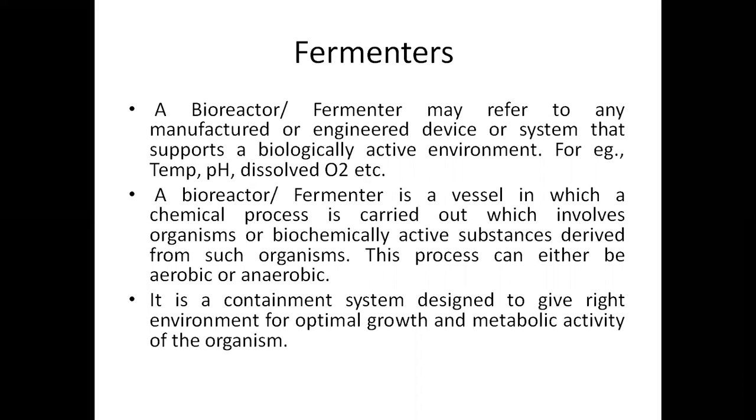A bioreactor or a fermenter may refer to any manufactured or engineered device or system that supports a biologically active environment, for example temperature, pH, dissolved oxygen, etc. So basically, it is a vessel in which different biochemical processes are carried out, involving the formation of the desired product, and the conversion of the substrate to the product can either be aerobic or anaerobic.